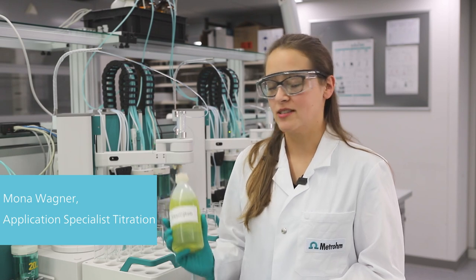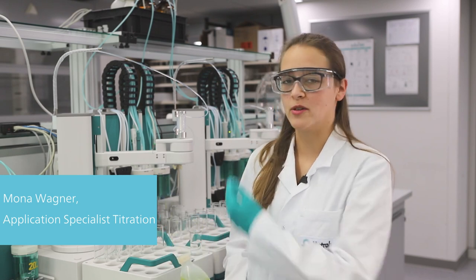Hey, my name is Mona. In this video we want to show you how to analyze your galvanic bath with this Omnis automated system.